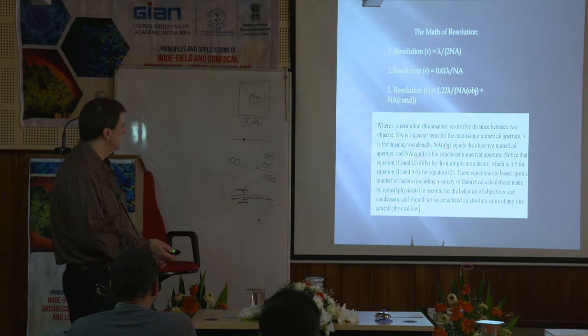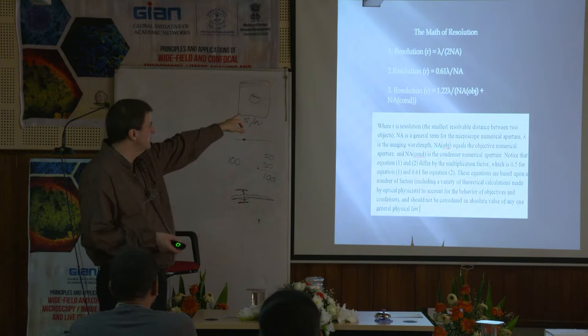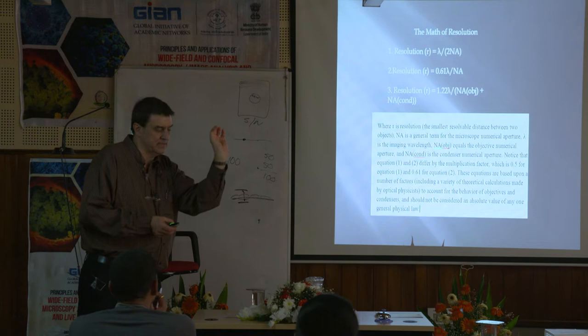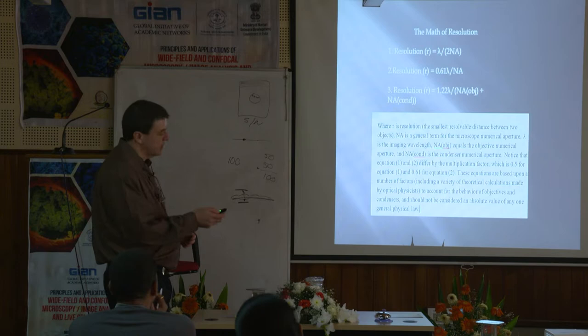And we went through this before. We talked about the math of resolution. Somebody asked me a question about why resolution got smaller, and I think jet lag got the better of me, but you want resolution to be smaller, because the smaller it is, the smaller the distance between two objects you can resolve. So the whole idea is to get the resolution number smaller. So I made a mistake if I explained it to somebody the other day. It's tough when you're on a plane for all those hours. Anyway, I feel better now though.